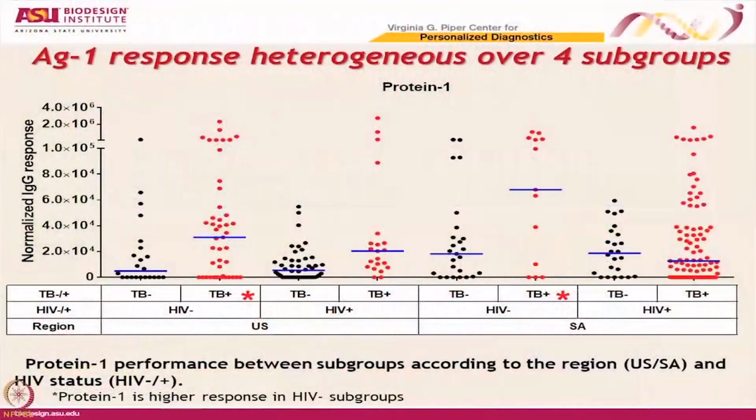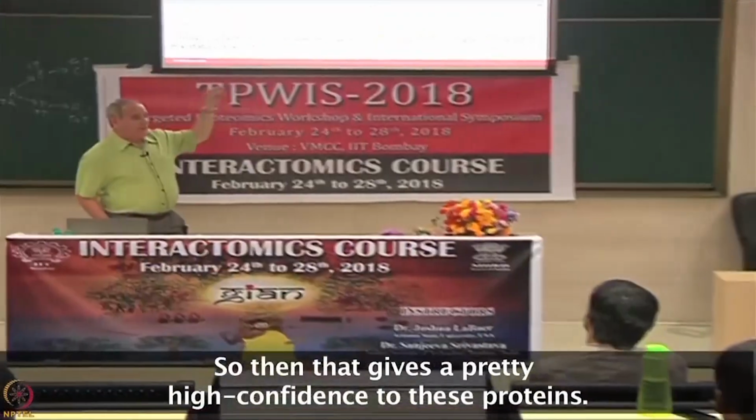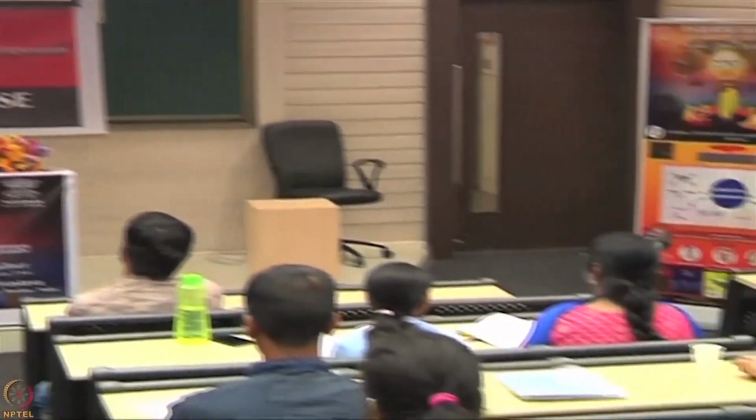All 40 were tested with ELISA. Yeah, and these results are ELISA results. Yeah, we're pretty highly confident with these.